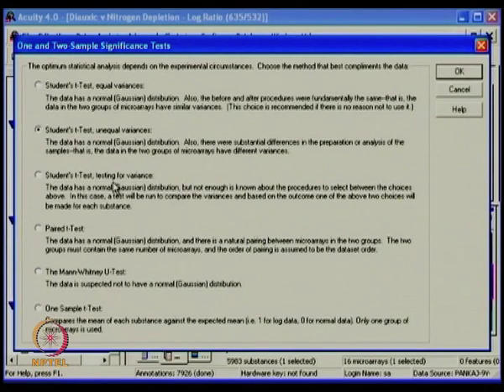There is also a student t-test for when you don't know what the variance is, and you prefer the paired test when the sample is coming from the same origin, especially in cancers, where when the cancer is removed surgically, people remove some normal sample, so the same biological patient is the origin. This allows one to select based on their background. The other one is the Mann-Whitney test, which people use where there is no normal Gaussian, for example when values are only standalone, up and down, that's it. So you select this parameter for that.